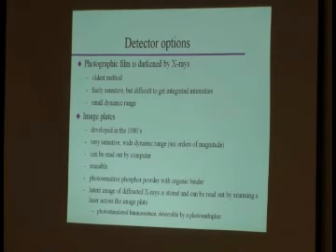The oldest method to detect X-rays was photographic film. That's what Röntgen used, okay? When you hit film with X-rays, it will get dark. It's fairly sensitive, so it will detect fairly small amounts of X-rays. However, it has a pretty small dynamic range, and it's pretty difficult to get integrated intensities out of film.